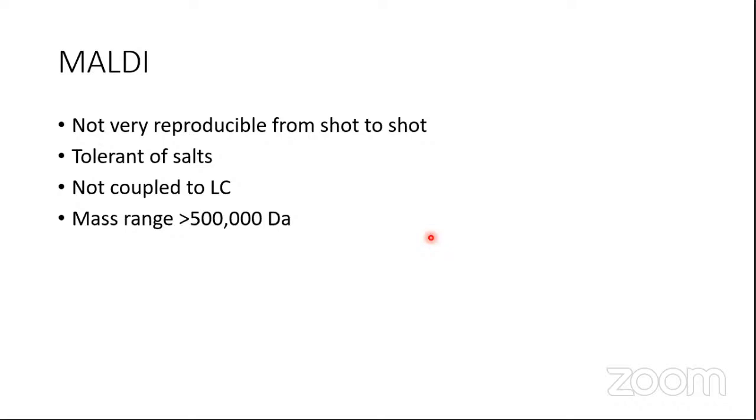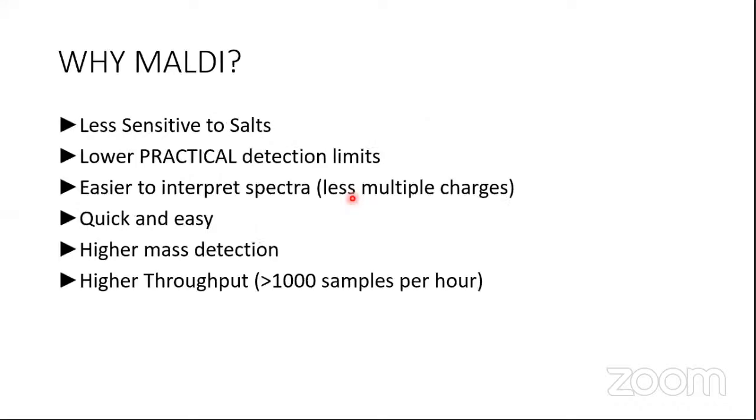Then I'm just going to talk a little bit about MALDI, because it is very popular as a technique, and many of you who are in the biological field know about what is called MALDI-TOF. So MALDI is one of the techniques which is used in protein analysis and gives you the structure of proteins and peptides, etc. And it is a very useful technique for proteomic studies. Okay, so I'm not going to get into that in detail.